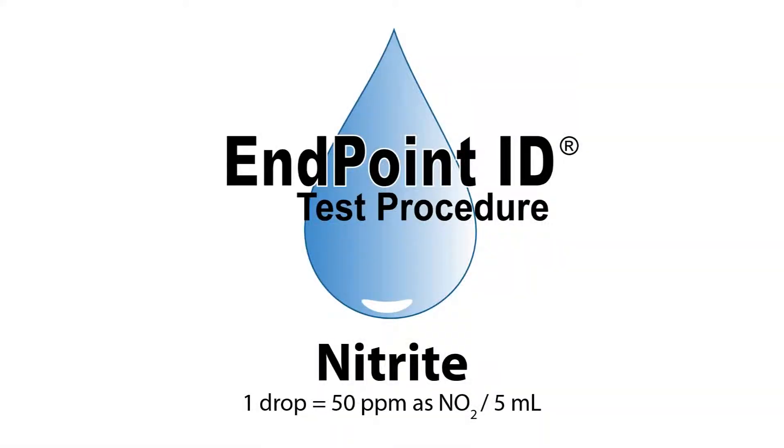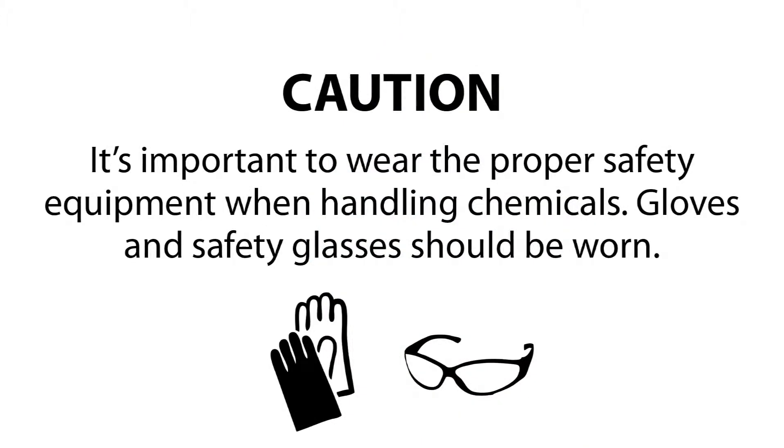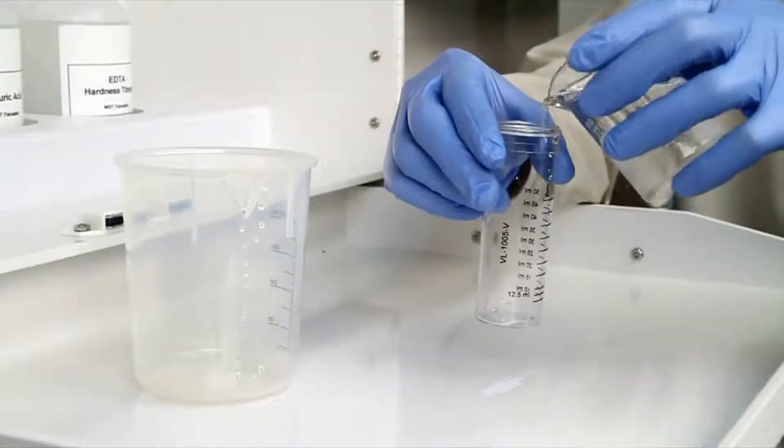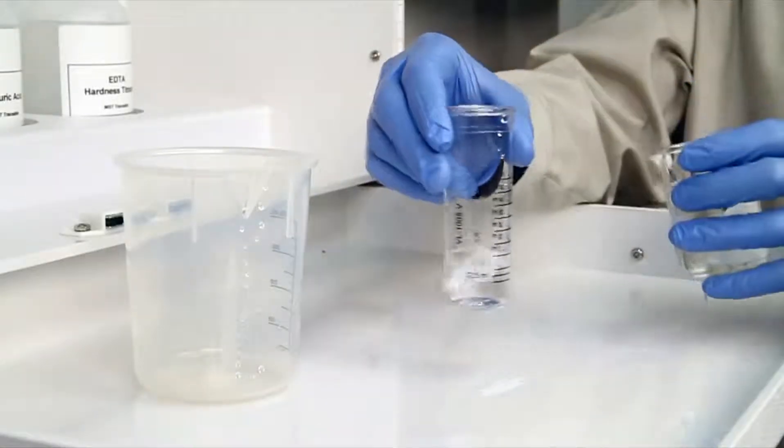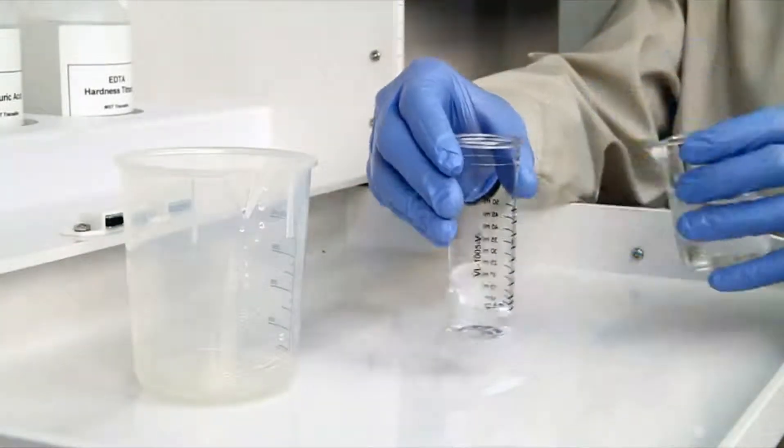This is a demonstration of a nitrite drop count test kit using endpoint ID procedures. The first step according to the endpoint ID procedure is to gather an accurate sample. The smallest change in sample size will lead to inaccurate results.